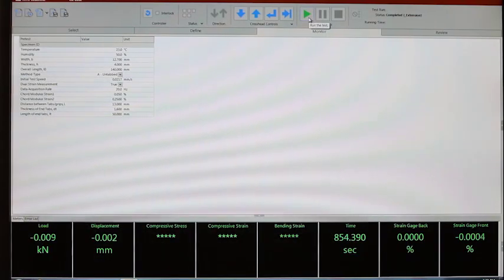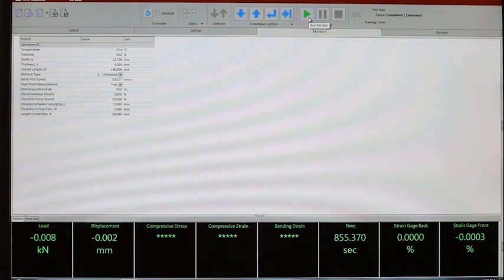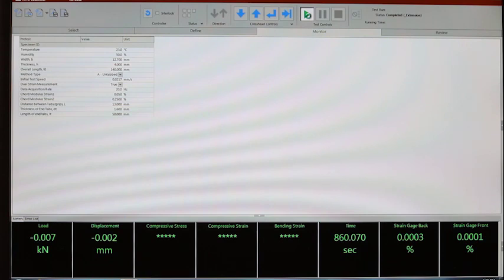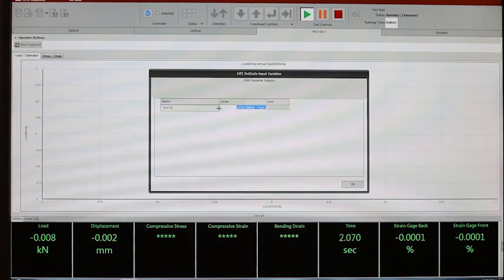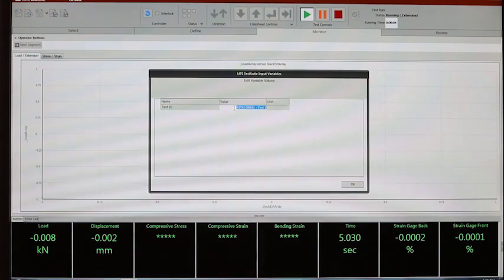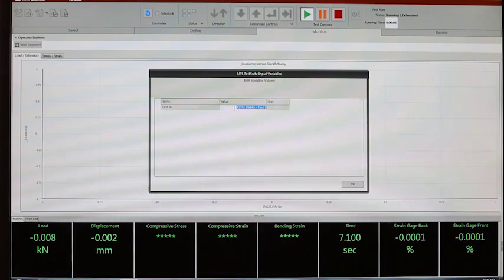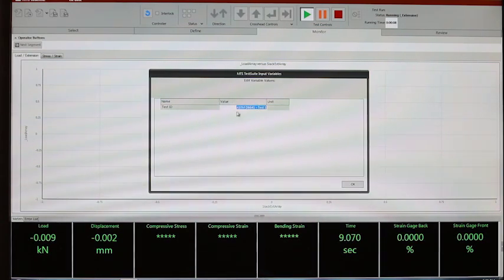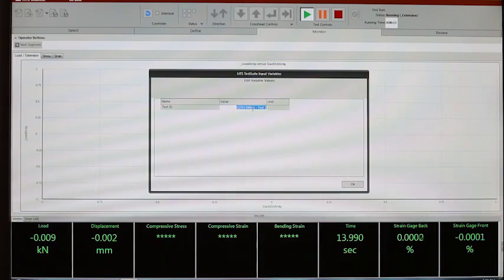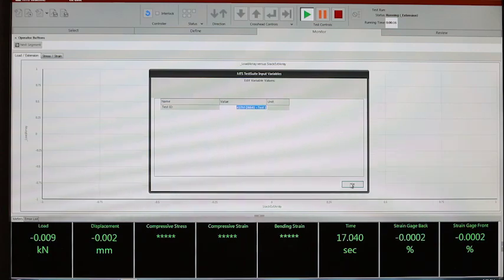In order to start the test, we are using the run test button on the upper part of the screen. The first time we run the test, we have the possibility to enter a test ID for the whole batch of specimens that we are testing. Here I just entered the generic name ASTM D6641, which is the ASTM standard for the compression test using the combined loading fixture.